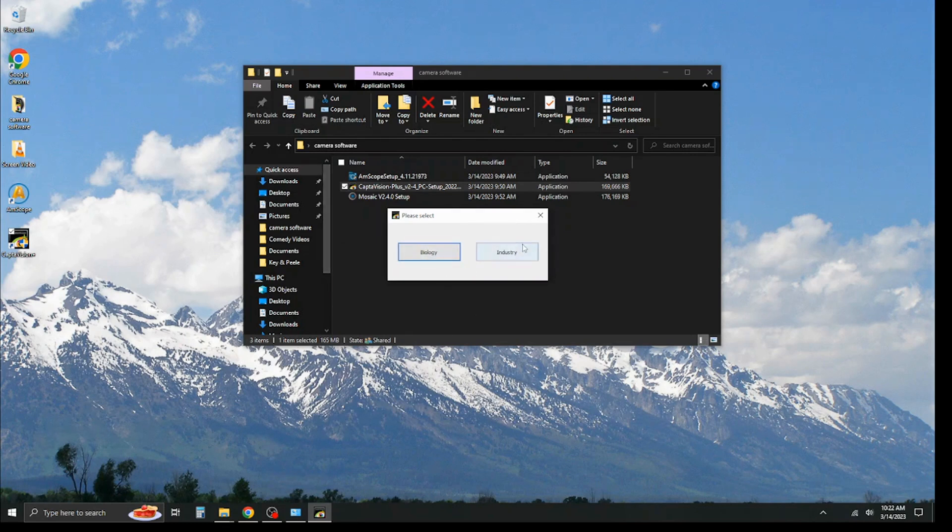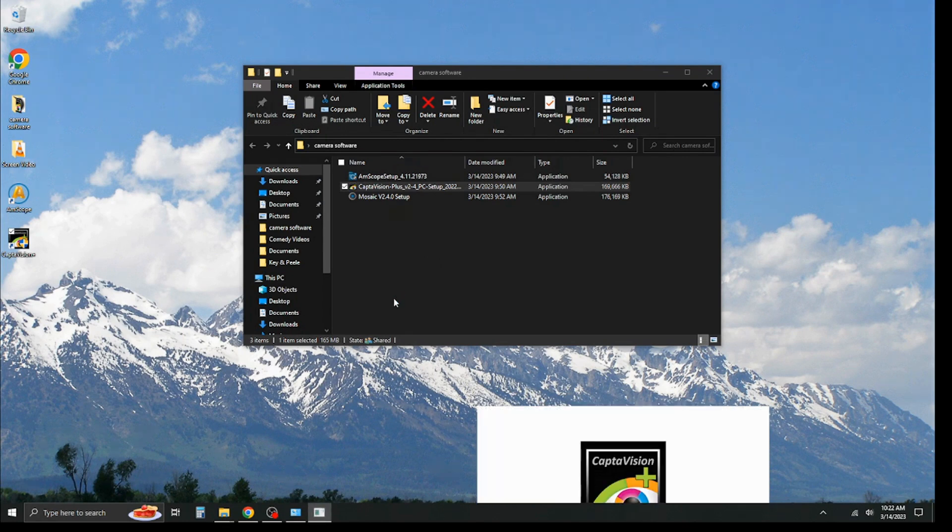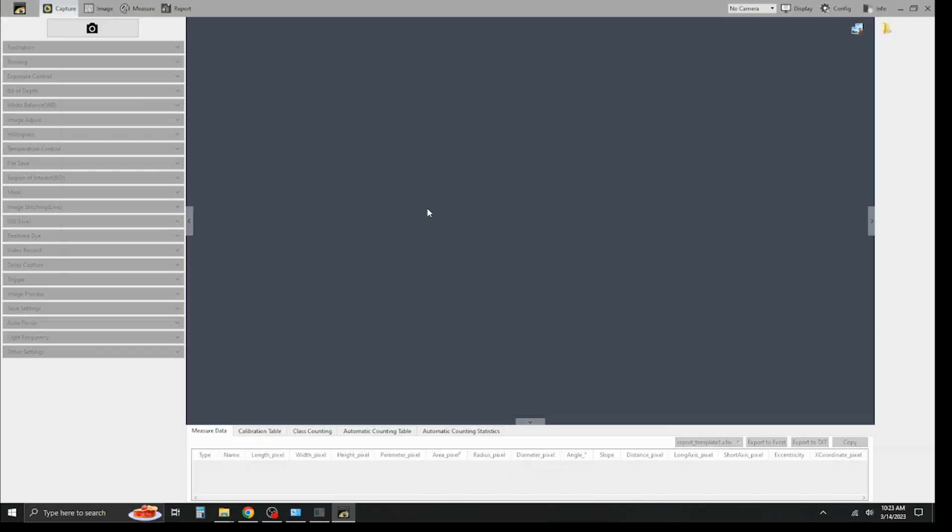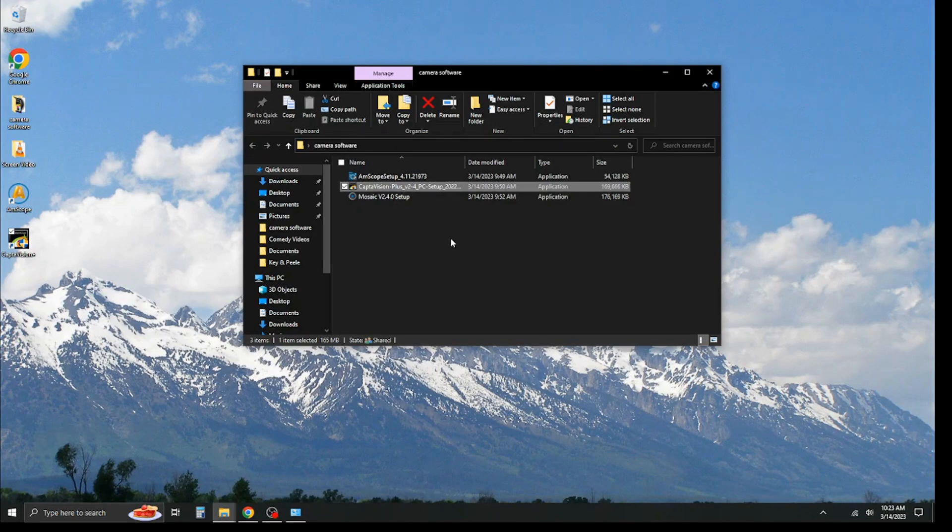Now, it's going to ask you for biology or industry. I'm going to go ahead and select biology just because that's our most common use case. And for some reason, it pops up down here, but give it one moment, and here you go. Here's your basic user interface. Again, we're not going to use the software right now. We're just going to clarify the installs, and it's going to ask you to close the window, and you hit yes.